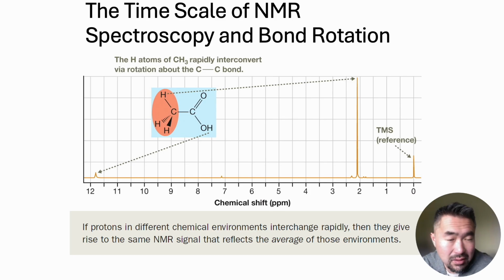Okay. Now, the other thing about NMR is you can tell a lot from the number of signals, the number of peaks you see. This spectrum shows 2 of them. Sometimes you see these tiny peaks. They're often impurities, or this tiny peak at 7.26 ppm. That's actually the tiny bit of proton present with the deuterated solvent you're using. It's deuterated chloroform, meaning all the hydrogens are replaced with deuterium so that it's NMR invisible. You don't see the signal, but in the process, there's always a tiny bit of regular hydrogen impurity instead of deuterium. So that's what you see here.